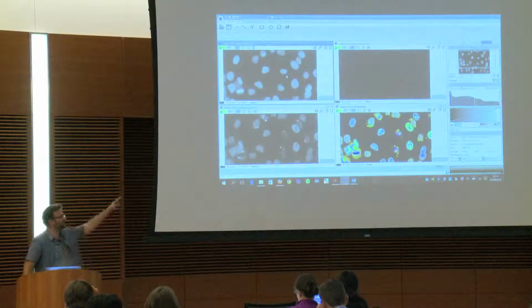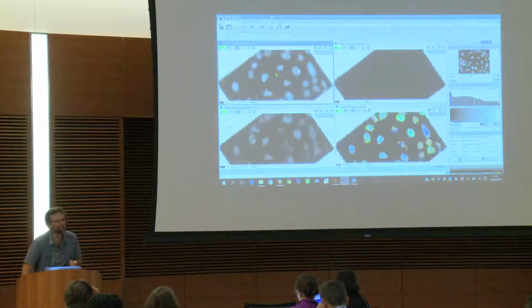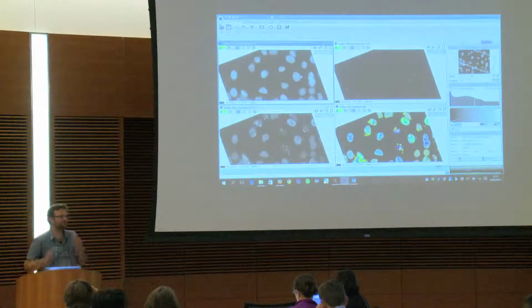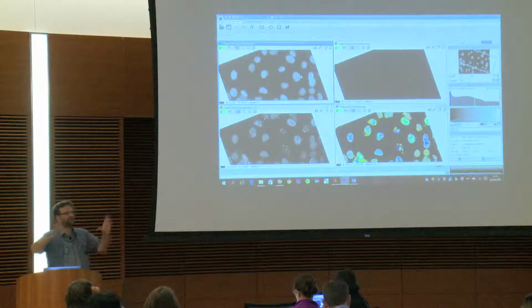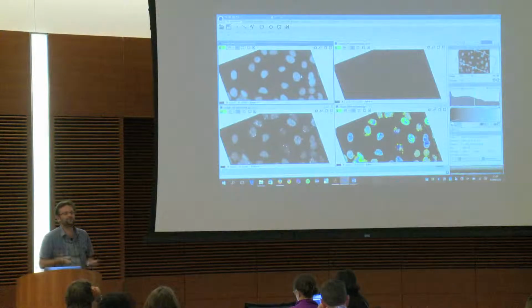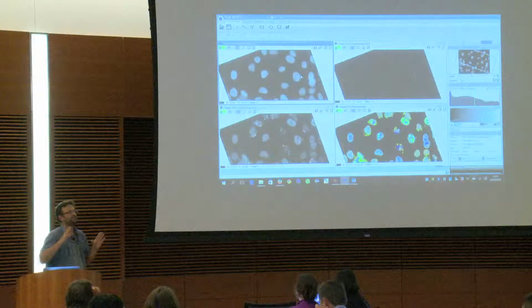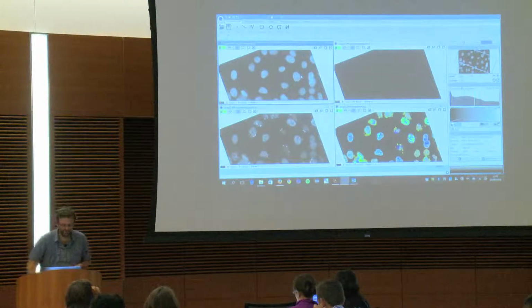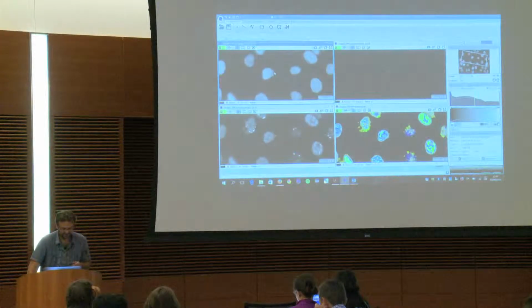There is another point, we saw it in another presentation, is that if you right-click, you can rotate your image. That's very important because we've seen a number of biologists take their images and then rotate them. But through the processing, you lose the noise of the image, and they don't consider that it's going to be a problem for us afterwards. So here in the viewer, you can rotate it, but you actually don't rotate your image. But it's cool if you want to find back a geometrical clue that you were missing.